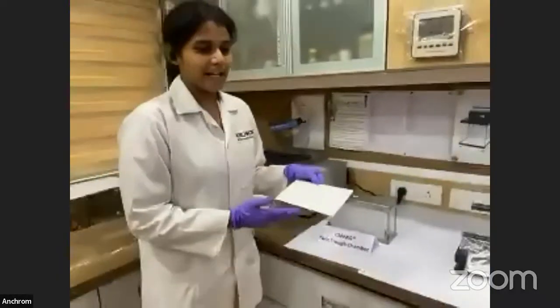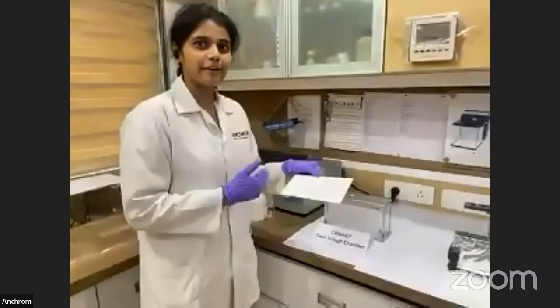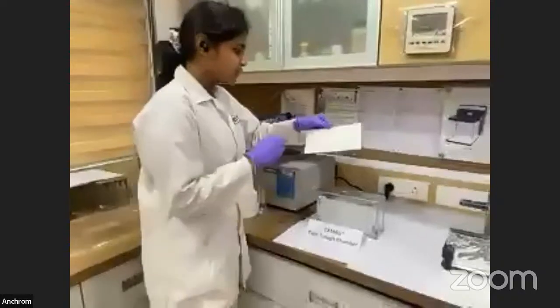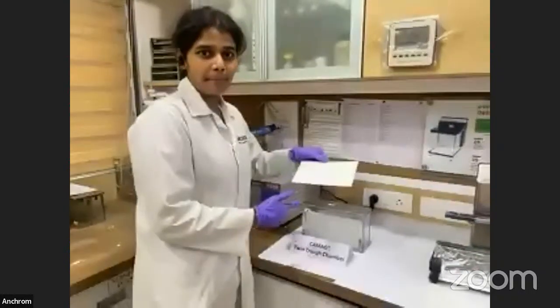So this is the demonstration. For that, we have kept our applied plate ready. So this applied plate will go for the development.